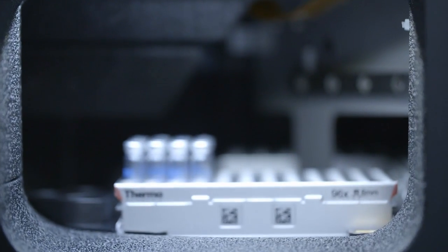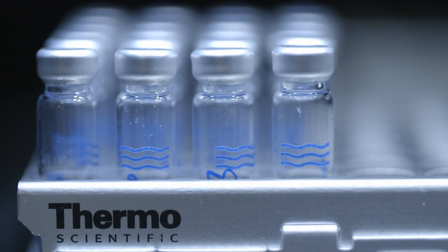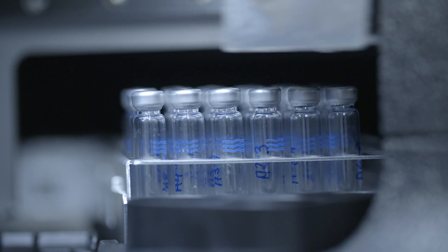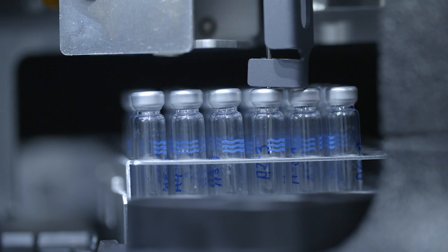I realized that the sample pre-compression is the major contributor to retention time precision. This is very important, especially in QC departments where you just compare retention times. This intelligent sample pre-compression brings the content of the sample loop up to system pressure before switching the injection valve, which virtually eliminates any mechanical pressure shock and pressure stress on the packed bed of the UHPLC column.